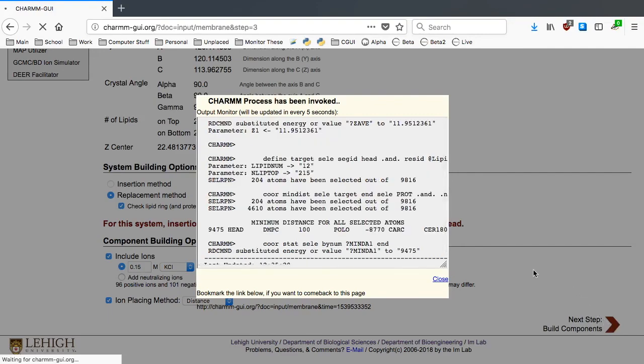In our example, it would take about 35-40 minutes. With bigger systems, you should expect even more time to finish this step, so you can use this bookmark link to check if your job is done later.